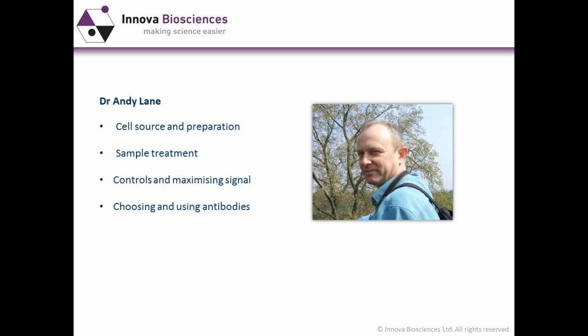Our speaker today is Dr. Andy Lane. Andy will discuss cell source and preparation, sample treatments, controls and maximizing signal, and choosing and using antibodies.